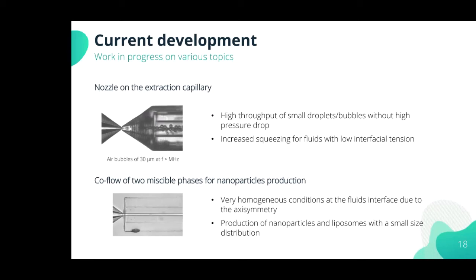What is the solvent compatibility with the photoresist used for the nozzle? Actually, this resin is proprietary, so we don't have all the chemicals used to make it. But from our experience, it's very resistant to most solvents: ethyl acetate, acetone, ethanol. We tested dichloromethane. But maybe we didn't test all these solvents for a long exposure, so we have no data for that. We know that short exposure is okay. Actually, it's an acrylate-based resin, so you can easily get the solvent compatibility on the web.